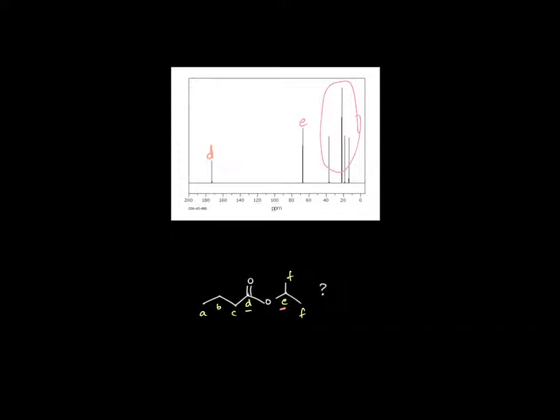And we have 4 peaks there. We would have 1, 2, 3, 4 other things to take care of. So this is definitely a possible match. Hopefully you can see how straightforward that is. In this case, we might not need that. We could probably figure out the identity of this molecule using hydrogen NMR, but it could serve as a confirmation. It doesn't take that long to run a carbon NMR, so it can be helpful.